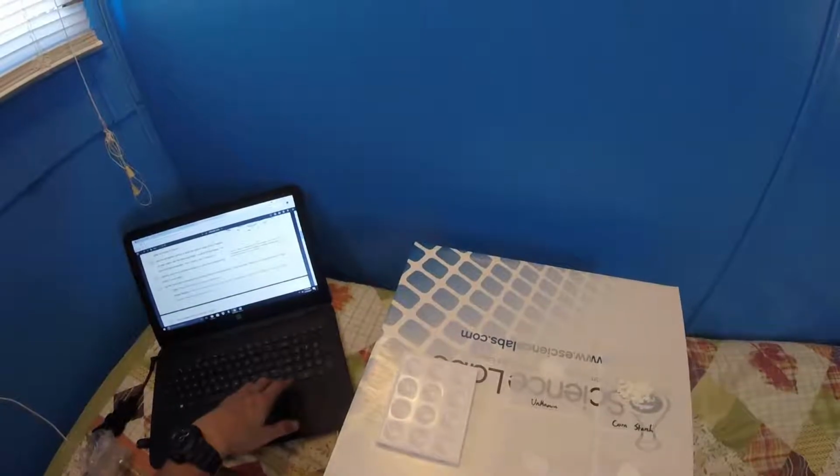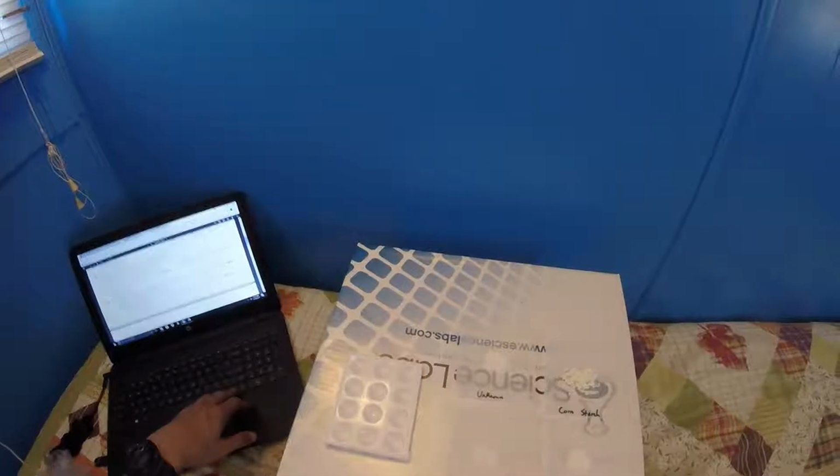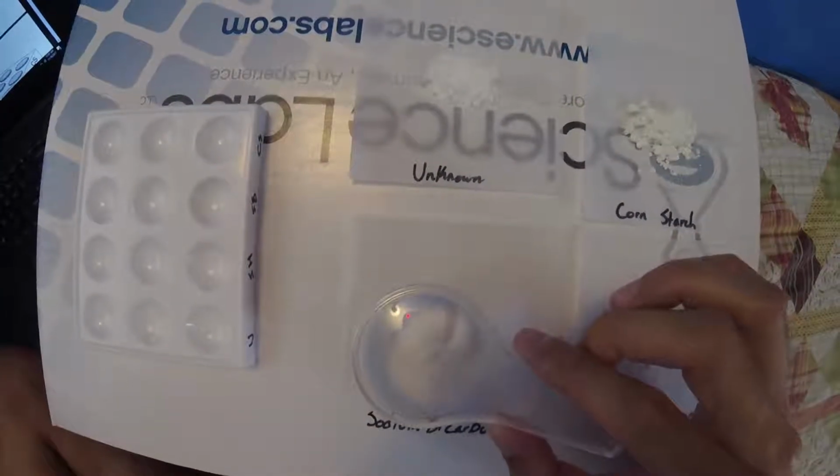And then we had to use a hand lens to observe the following physical characteristics of each powder. Record the observations in Table 2. So, the sodium bicarbonate, it's a crystal-like powder.